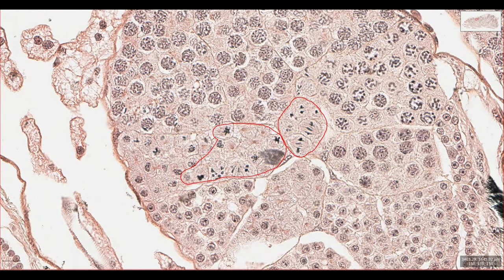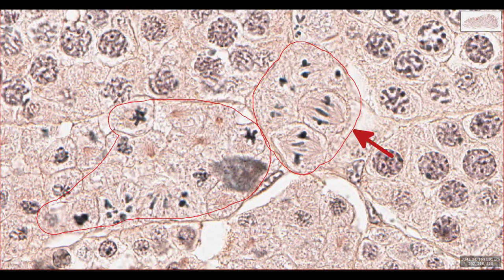The best example I found on the slide is this part here. In these two or three cells you can see chromosomes lining up along the centre of the cell. Each one is attached to one of the two cell poles by spindle fibres, which you can just about make out as a streaky appearance in the cell cytoplasm. These spindle fibres will drag the chromosomes into their respective cell pole before the cell splits. There's no way for me to tell if this is the first or second division in meiosis, but it illustrates the metaphase of the cell cycle wonderfully.